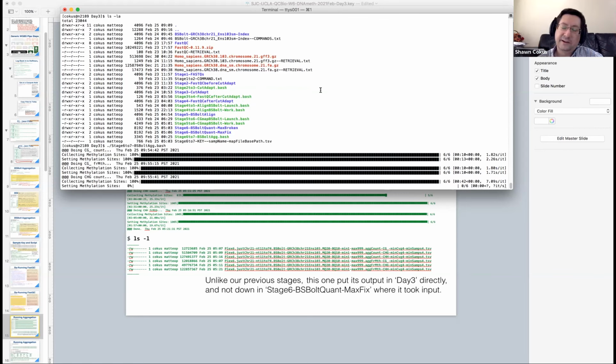So they left out that line of code that says, oh yeah, we finished the loop, so the progress bar should be forced to 100% update. It doesn't affect anything. It's just a visual thing. Details.